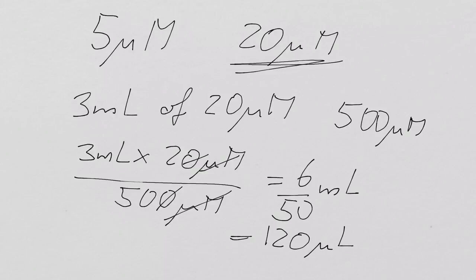Got that? 120 microliters? Yeah? Give yourself a pat if you got that. If you didn't, don't give yourself a pat.